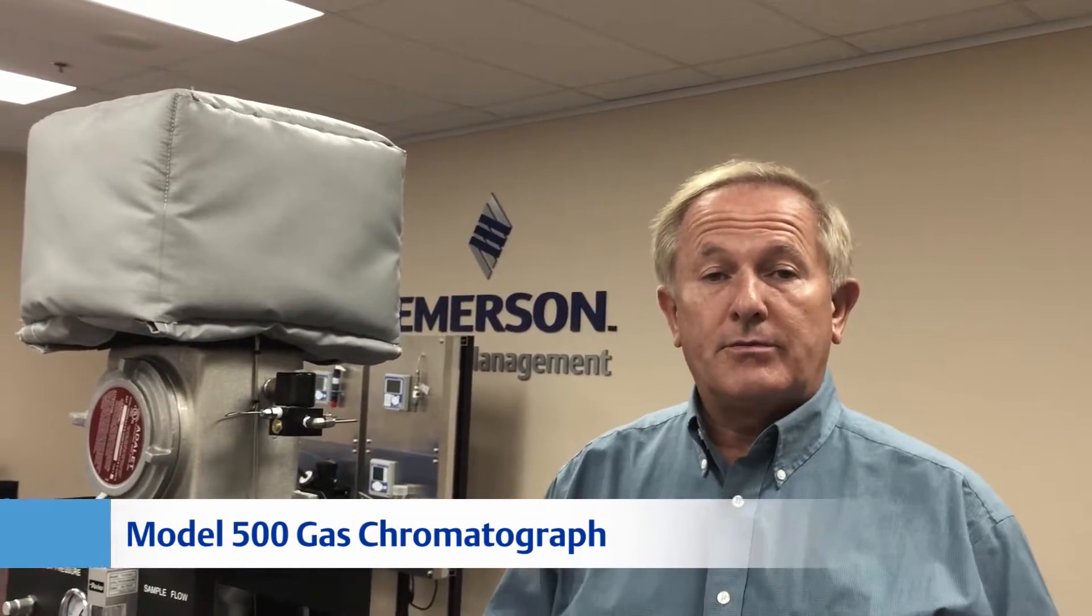Hello. Today we're going to discuss the upgrade of the Fabco valve on our Model 500 GCs. The reasons for this upgrade are for two important reasons.